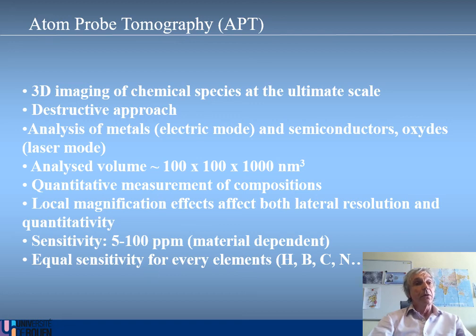One strong point of atom probe tomography is that you've got equal sensitivity to every element in principle. And you can detect from hydrogen, boron, carbon, nitrogen, up to refractory elements.